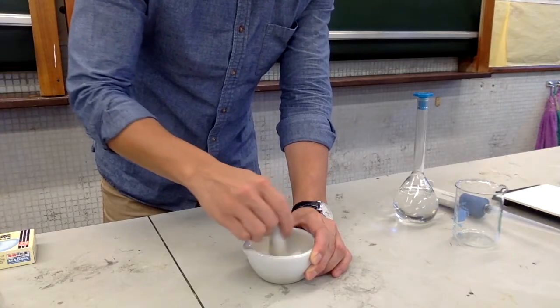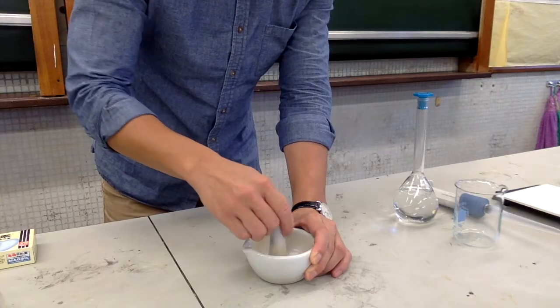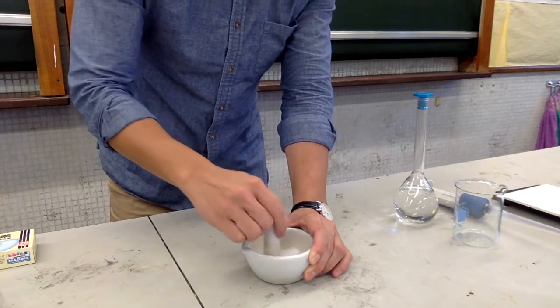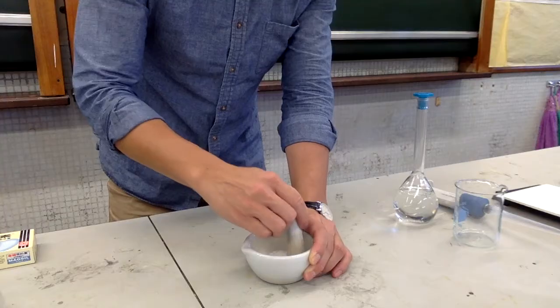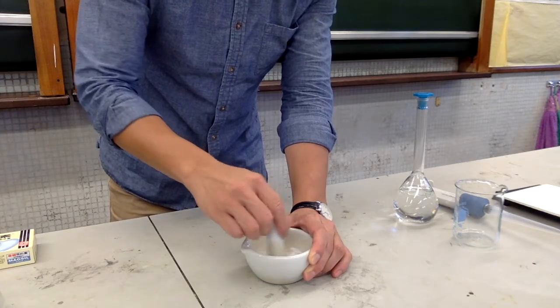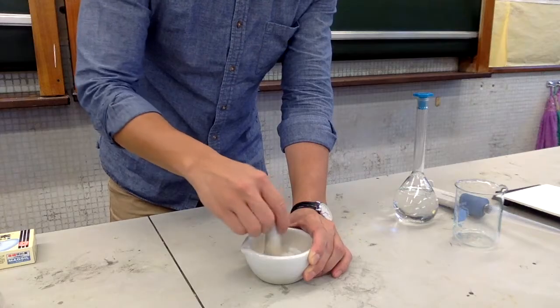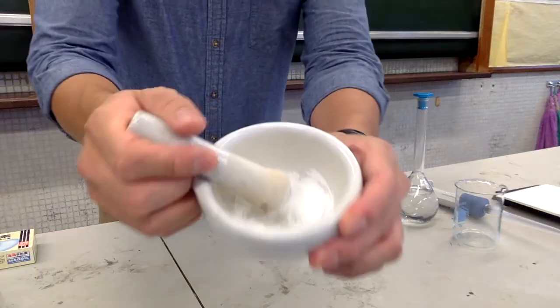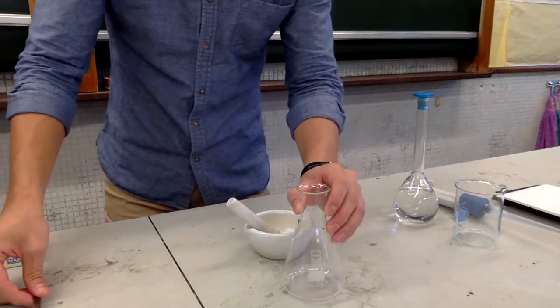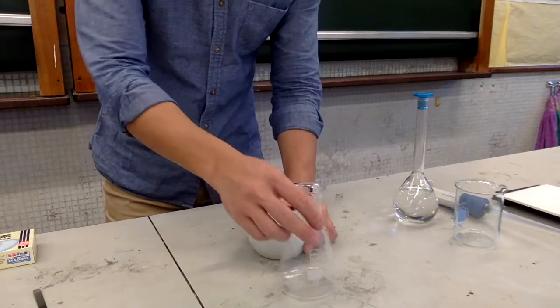This step is to increase the surface area of the antacid tablet so that it can react faster with the hydrochloric acid. This is to make sure that all the active ingredient, especially the aluminum hydroxide, has reacted with the acid. Now, carefully transfer all the powder into a conical flask.